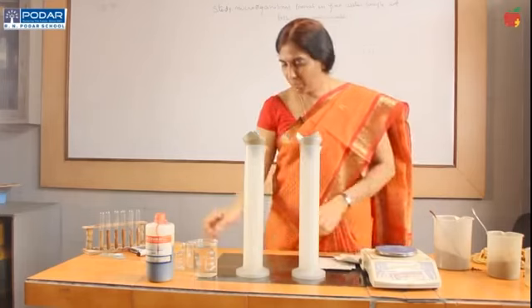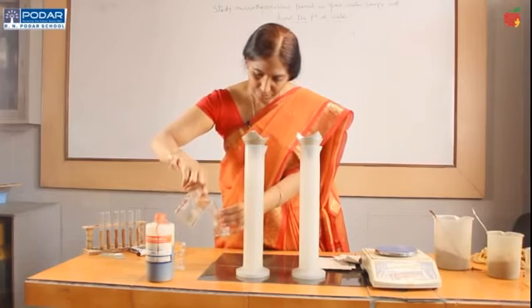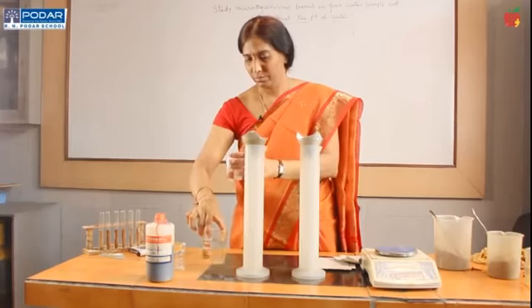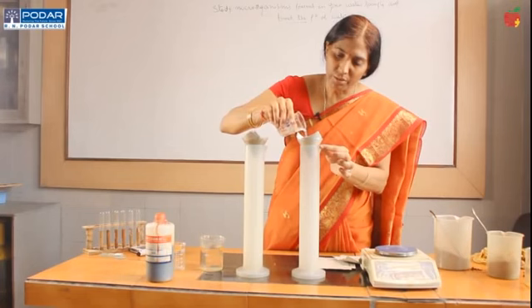Now, I have taken 50 ml of water, and I am pouring an equal amount of water, 50 ml, into these two cylinders.